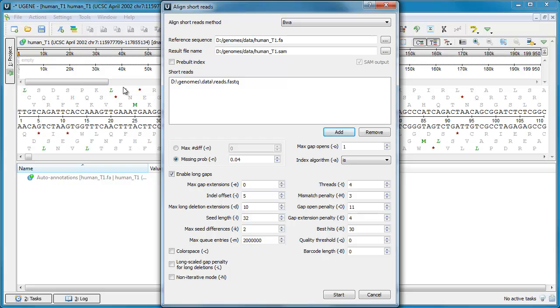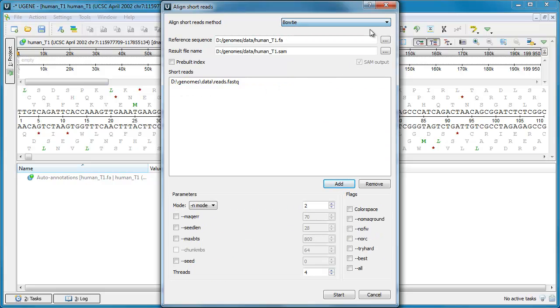Another short reads aligner, Bowtie, was also changed. It is now used as an external tool as well. An option to work with the color space was added, which is important to align reads produced by solid platform.